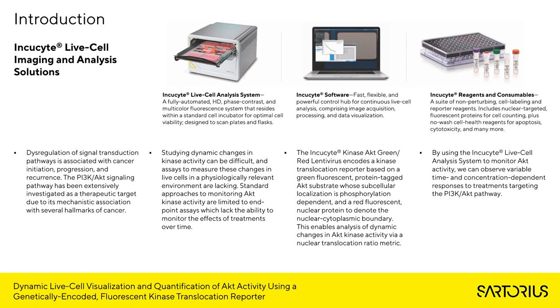By using the IncuCyte live cell analysis system to monitor AKT activity, we can observe variable time and concentration-dependent responses to treatments targeting the PI3K AKT pathway.